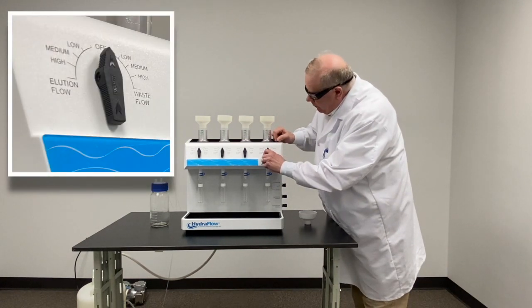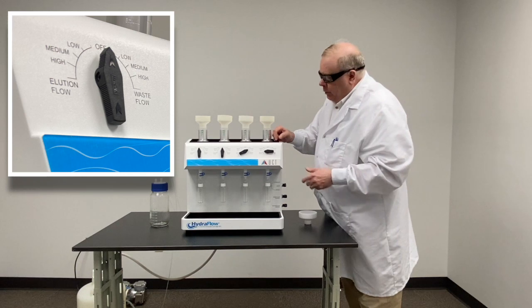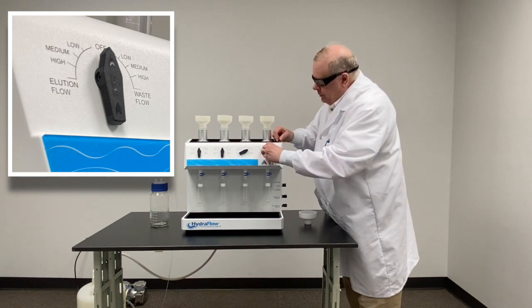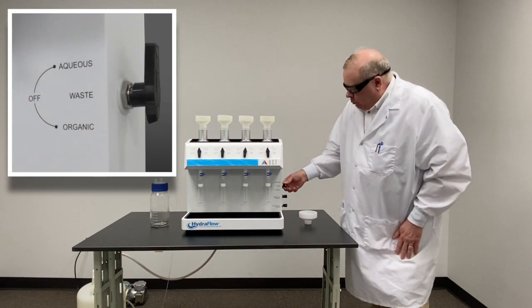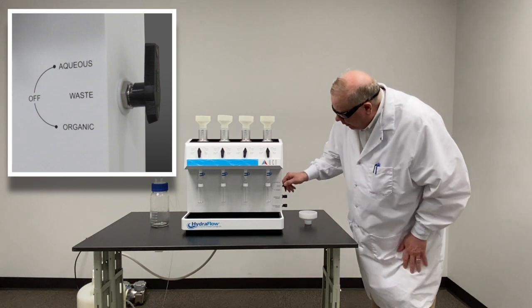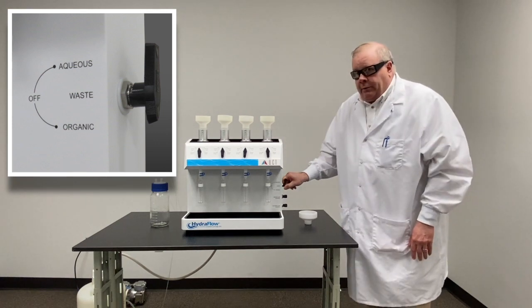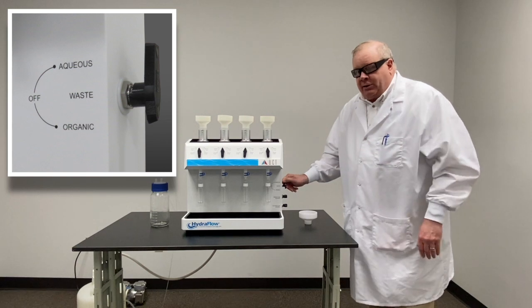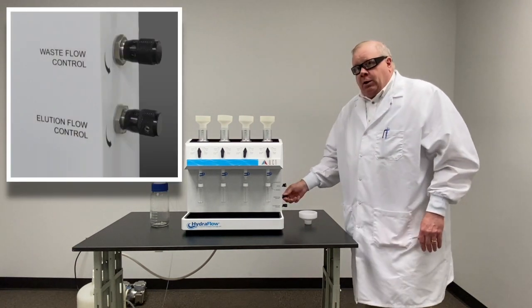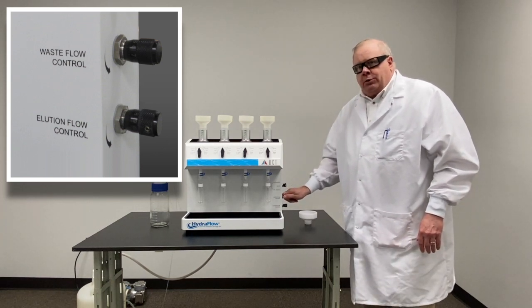We can both elute with our selector knob, or we can send product to waste, so we can do two different things at one time on each station. We can shunt the waste wherever we want it to go — to organic waste or to aqueous waste — that way we're separating your waste flow path so we're not getting your organics mixed in with your aqueous. Down here we have very fine flow control of your vacuum pressure for your elution and also for your waste.